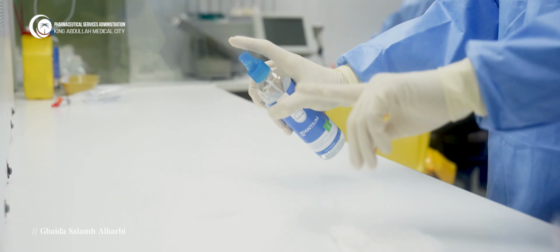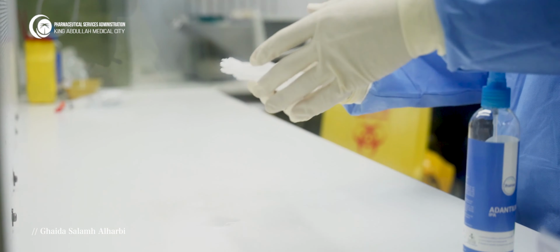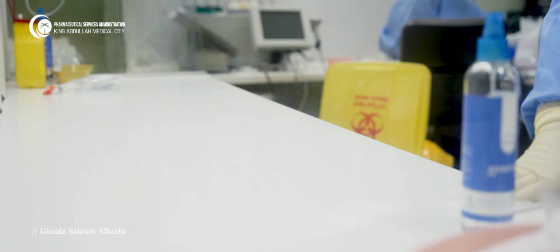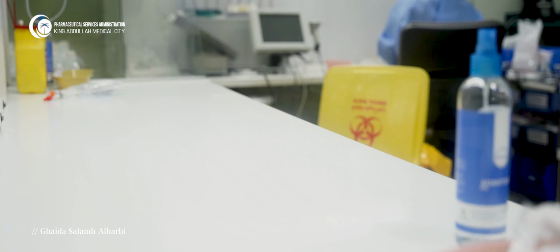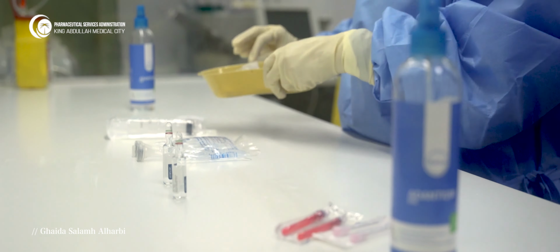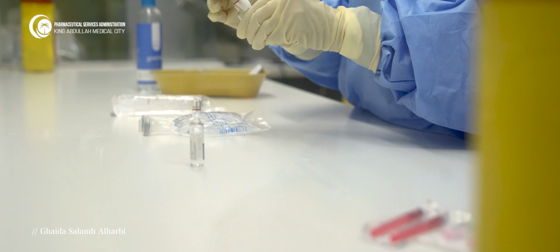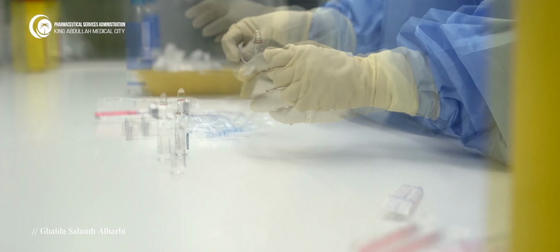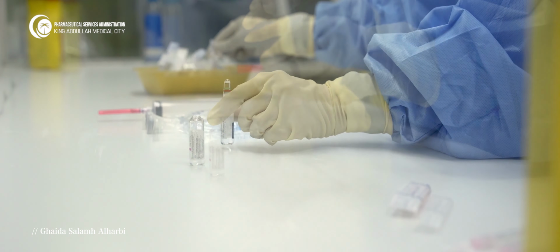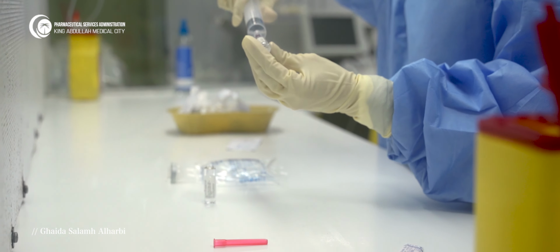While I clean the hood, I should clean by wiping, not spraying. Avoid splashing any liquid into the filter, as this can affect the filter. If I have preparation from a glass ampule, first I will disinfect the ampule 3 times in the same direction, then I will open the ampule, then I will take the medication using a filter needle.